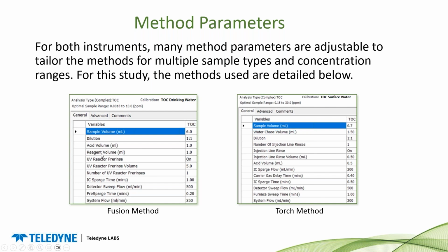You've got other things like reagent volume, a reactor pre-rinse, detector sweep flow, pre-sparge time, and the system flow for flushing everything through to the detector.